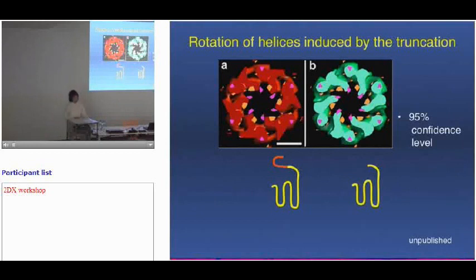Now, to update, I think in 2008 a connexin 26 crystal structure came out of this type of protein. When I docked that into here, I can find out exactly which transmembrane helix is responsible for all those changes that I observe here. From the differences, you can say that here is the helix closer to the pore that is doing some sort of a rotation and movement.